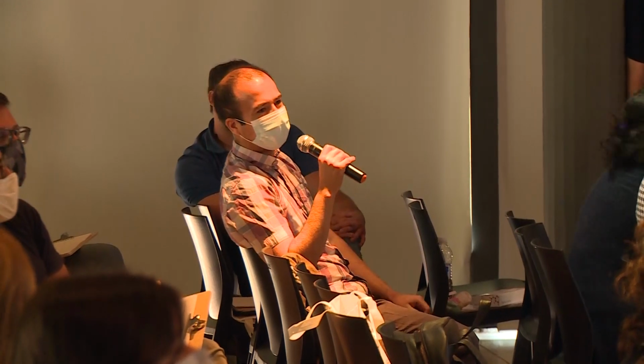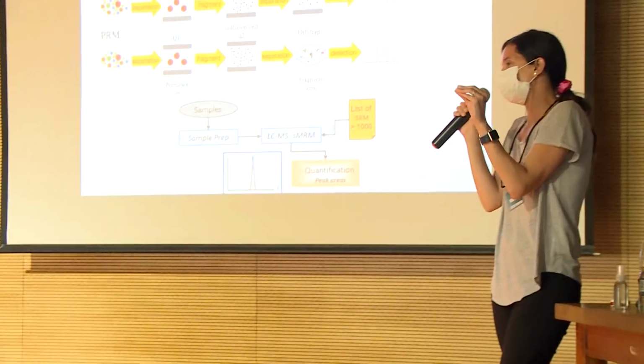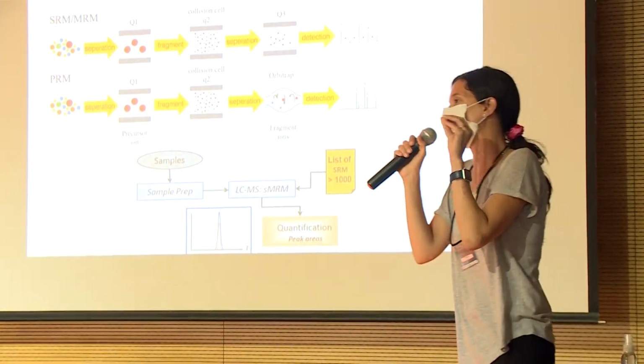Yeah, because it's so difficult. Yes, membrane proteins are the worst. In Spanish we say "para bailar con la más fea." I don't have a lot of experience with membrane proteins. The key there is sample preparation.